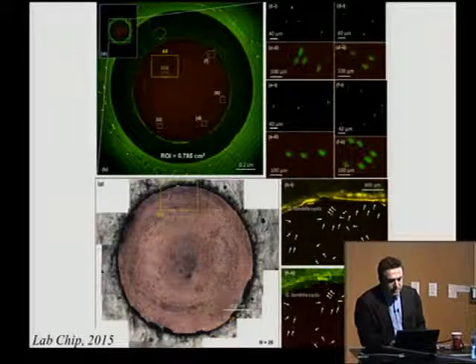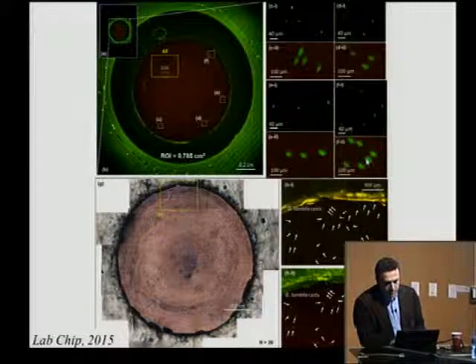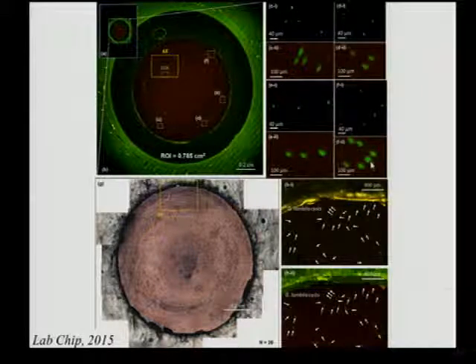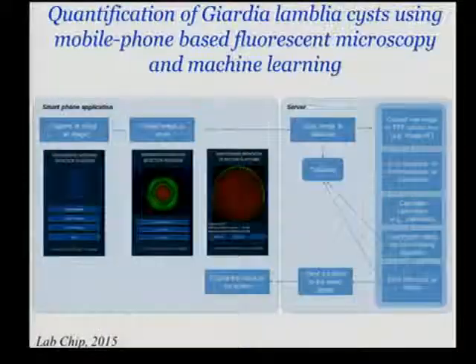This is actually a microscope image, cell phone microscope image. If you zoom in, you would be seeing these rugby ball type of Giardia cysts that are sent to a server for quantification, and the results come back. This has achieved about a cyst per mil limit of detection, which is pretty good for something like this quick. We're now pushing the sensitivity further for this platform.